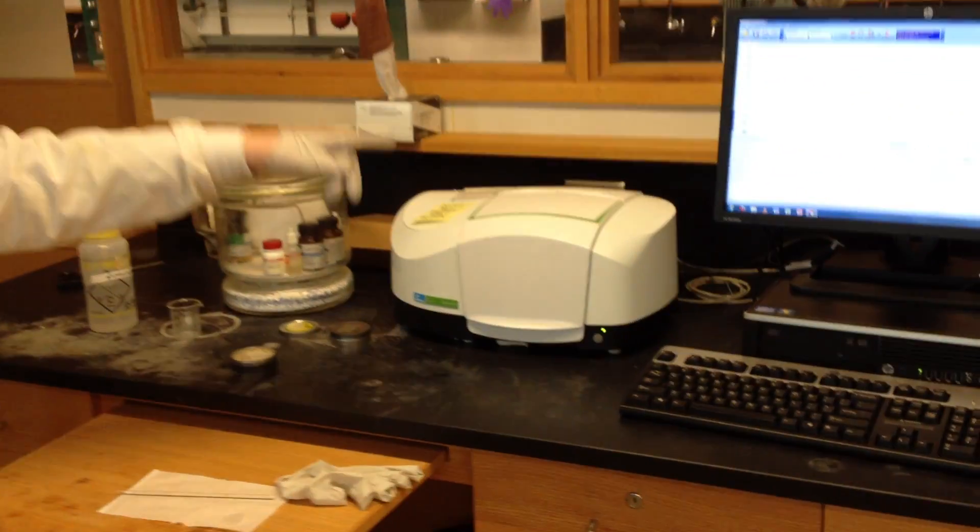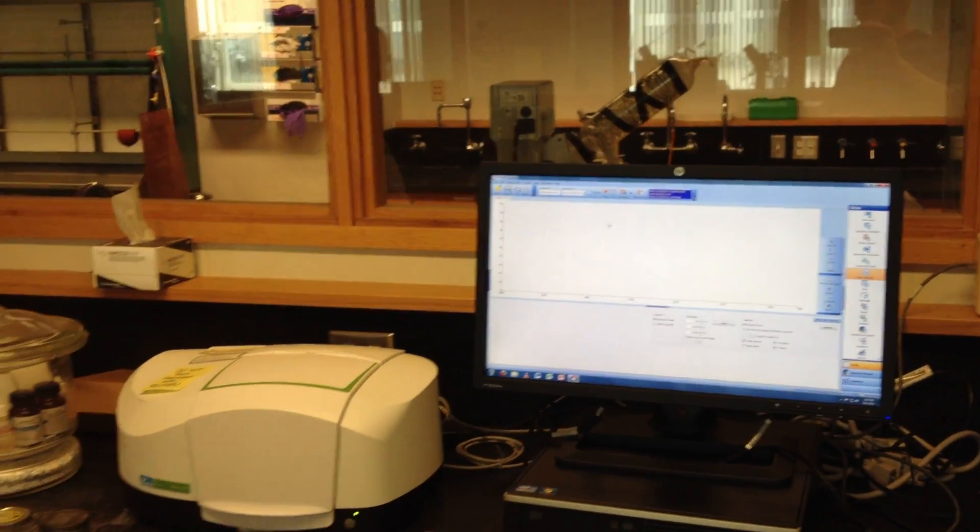Infrared is a methodology to start, or at least sometimes completely, but at least start figuring out the structure of a compound. The infrared spectrometer is right over here. This is the spectrometer, and this is the computer that has the software that runs the spectrometer.